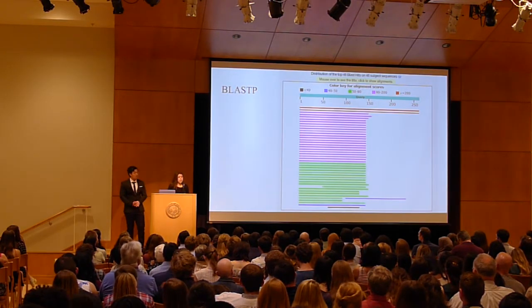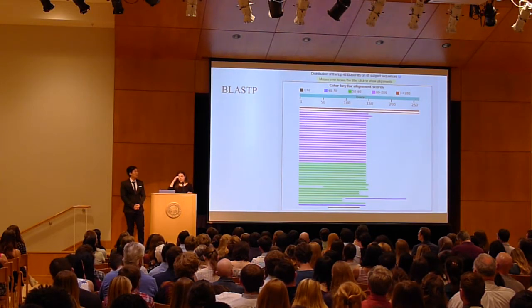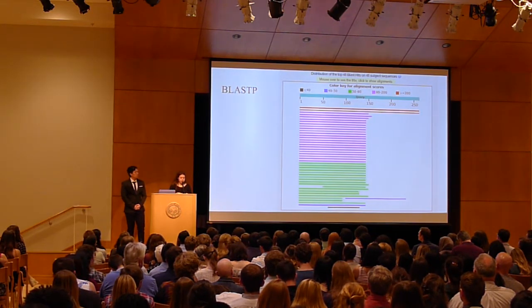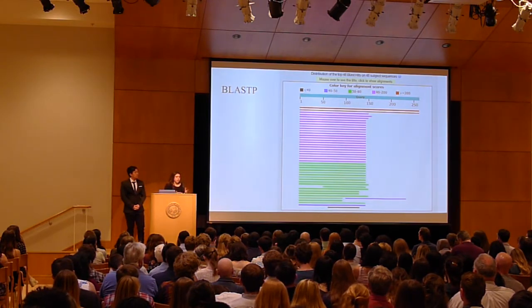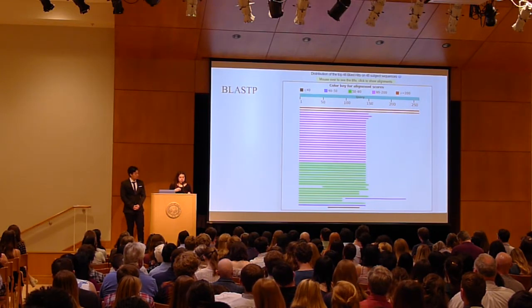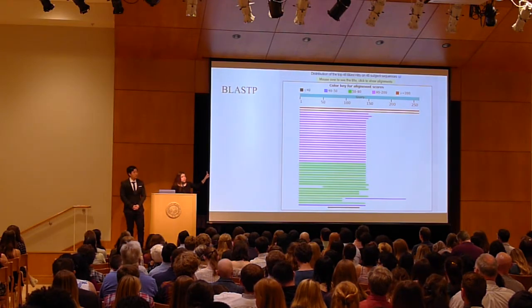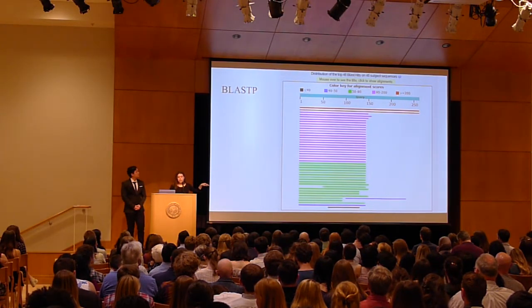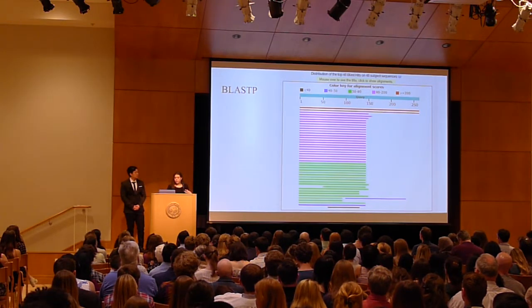Once we're done with that, we'll take the amino acid sequence from DNA Master and plug it into what's called BLASTp, which takes all of the other sequenced phages that have existed and compares our gene of interest to those genes, looking for homology. The query at the top is our gene of interest, and each colored line below is a possible hit or a possible match that shows how much of the gene it actually agrees with.